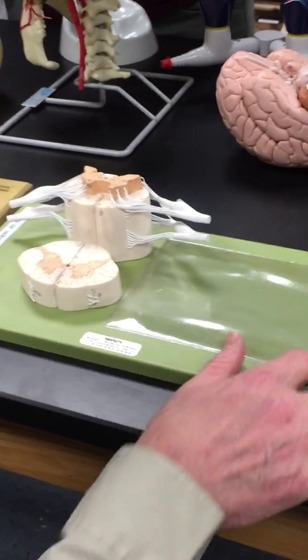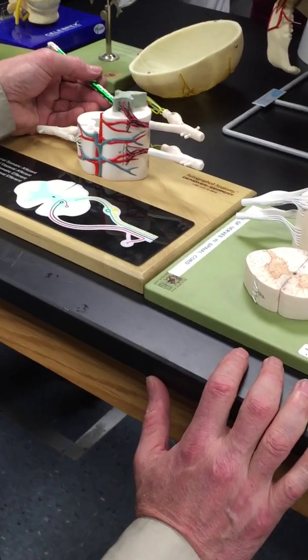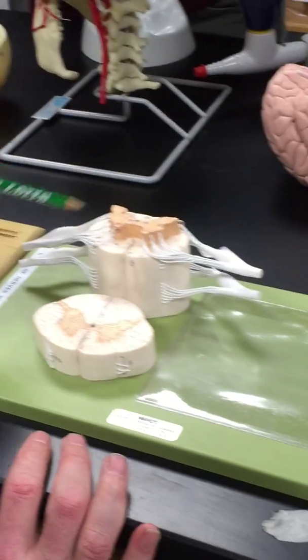Well, look at both of them. One thing, this one you can get a quick reference because there's words written, so you know this has got to be dorsal or posterior. This has to be ventral or anterior. But I always look at the dorsal root ganglia as a means to know where you're at.